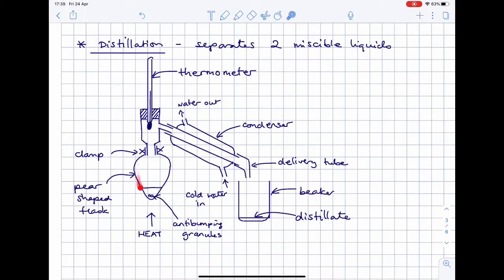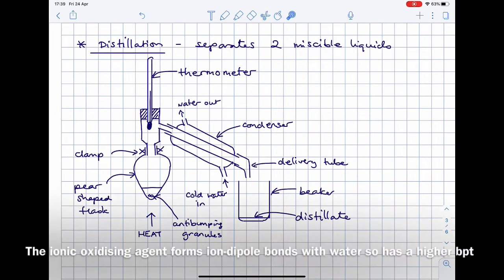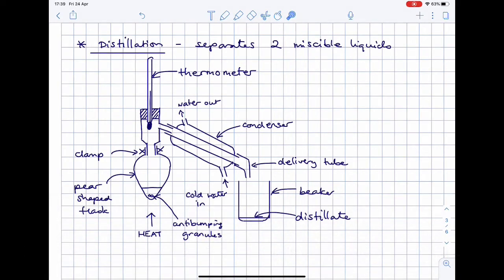So if we heat the mixture to the boiling point of the aldehyde, as soon as the aldehyde is produced, it would boil off and vaporize away from the oxidizing agent, leaving the alcohol, which has a high boiling point, to remain as a liquid here. The aldehyde then will be condensed and collected as the major product because it's condensed away from the oxidizing agent, preventing it from further oxidizing to give you the carboxylic acid.